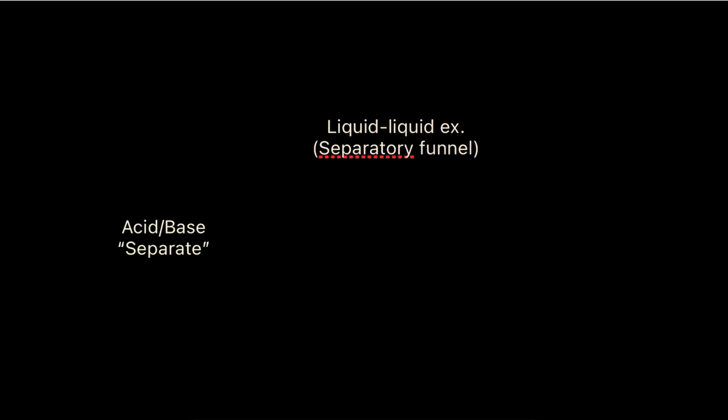In today's video, we will talk about the chemistry lab, the process and the theory behind liquid-liquid extraction of acid and bases using a separatory funnel. So if the lab exam gives you this prompt, separate acid base, you would use a separatory funnel process and not the distillation extraction process, okay? So let's start with some theory.